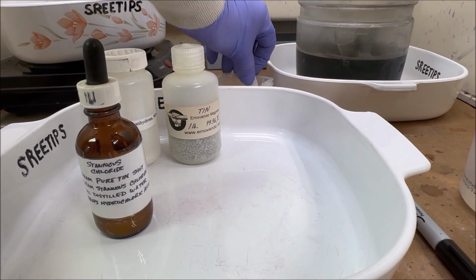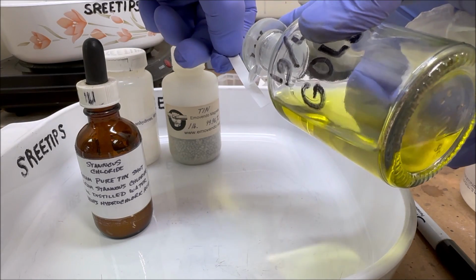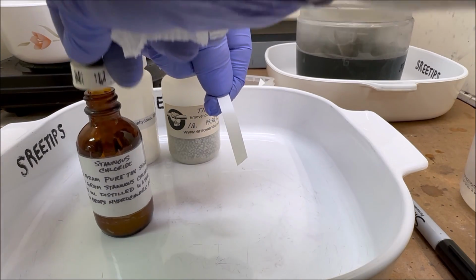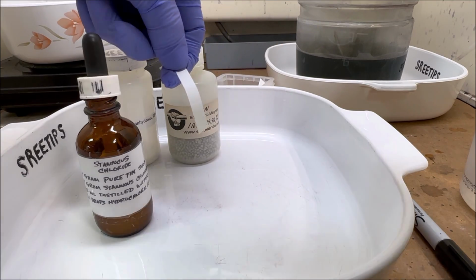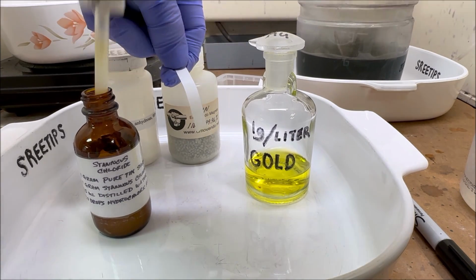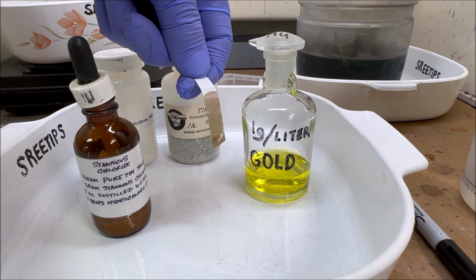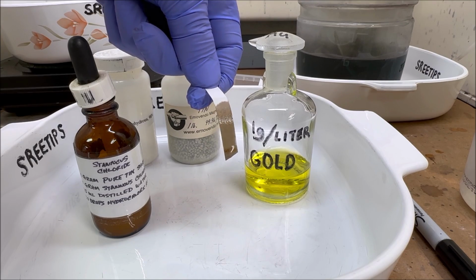Let's go ahead and test our stannous that we just made. I've got some gold in solution in this container right here. It's a standard test solution, 1 gram per liter. And we're going to test our testing solution and make sure it works correctly. And there you can see by that stain that it works correctly.